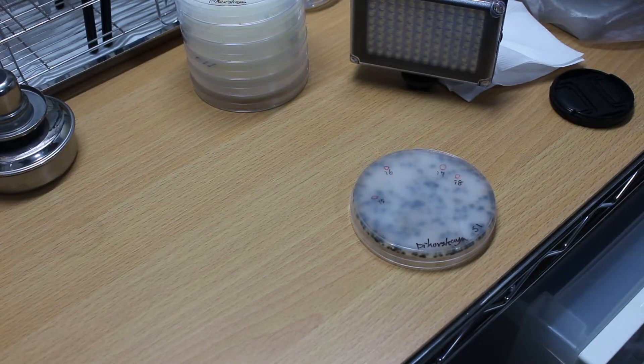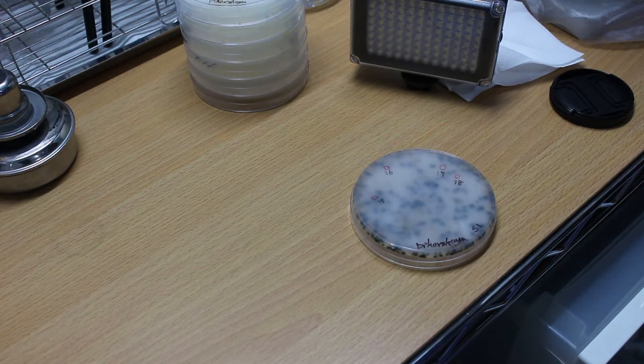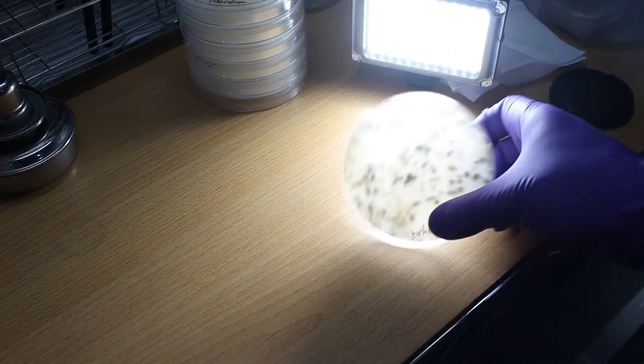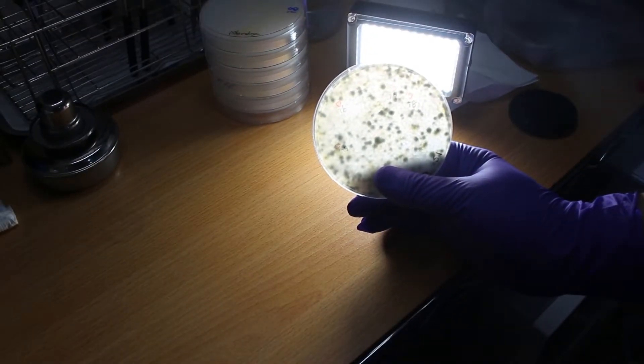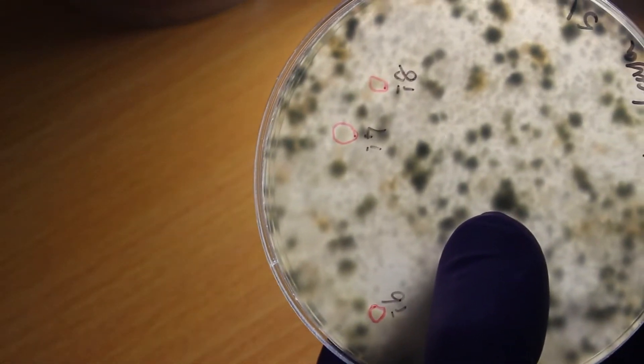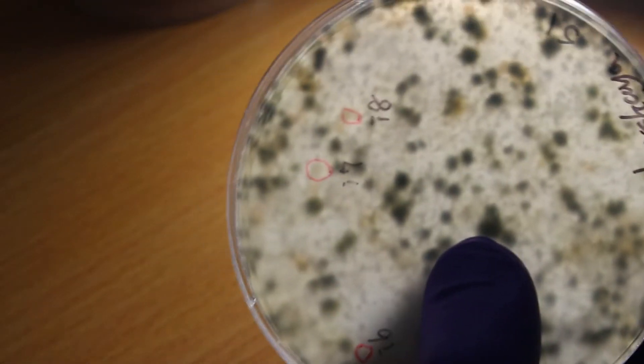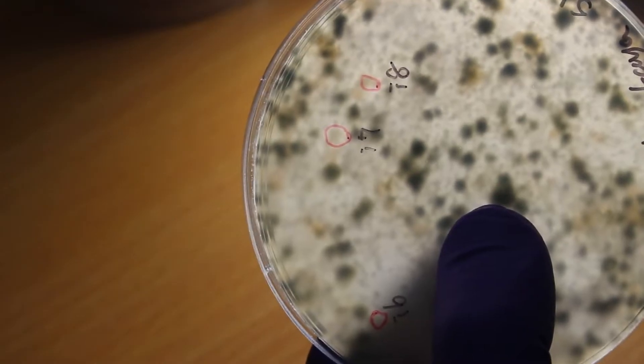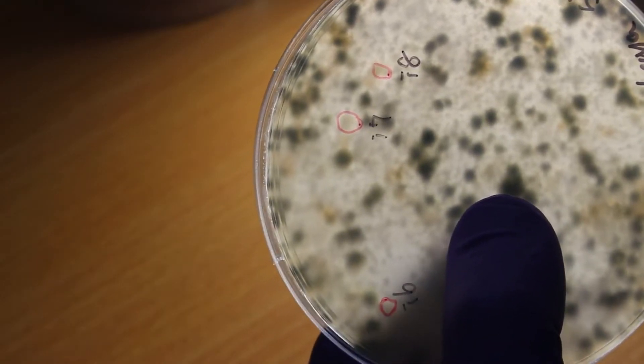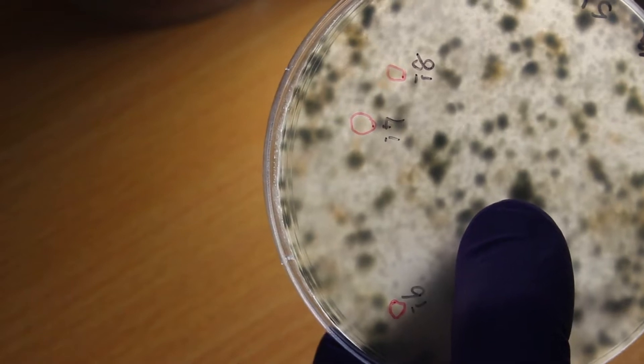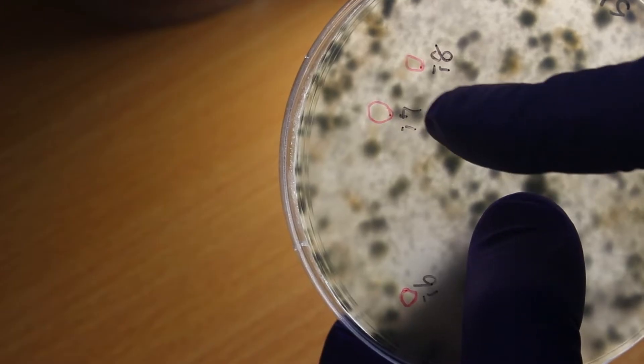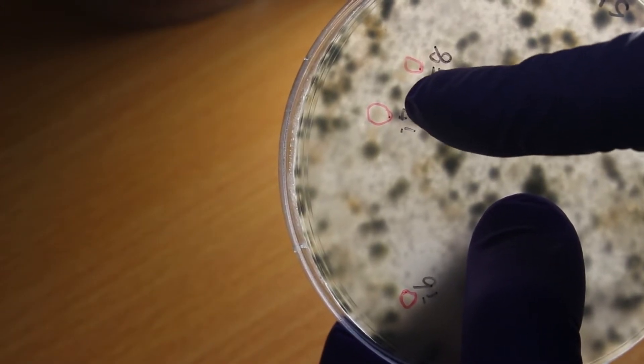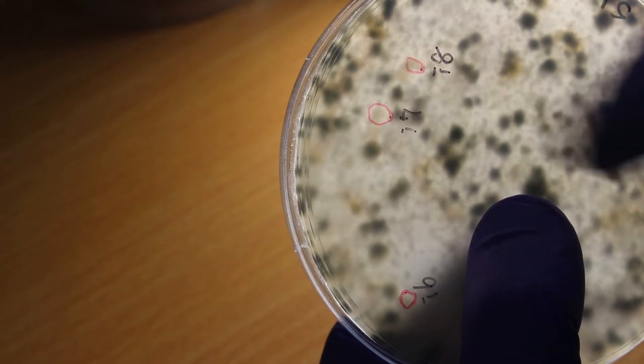After that, place the plate on the light to observe carefully. If you see a transparent ring around some of the bacteria colony, which might not be very obvious and require careful observation at a specific angle under the light to see clearly, this ring represents the dissolution of calcium phosphate in the agar by the bacteria, causing the white area to disappear and become more transparent. This is what we are looking for, the phosphate solubilizing bacteria.